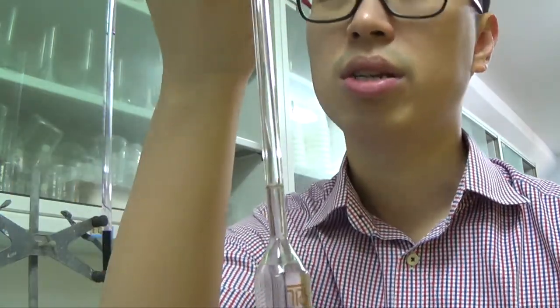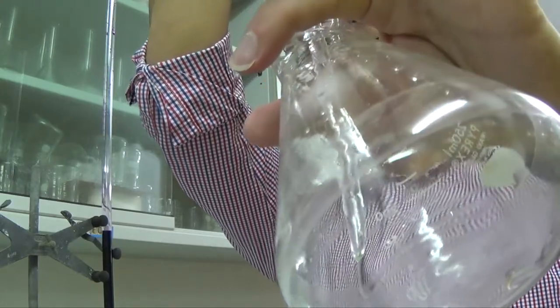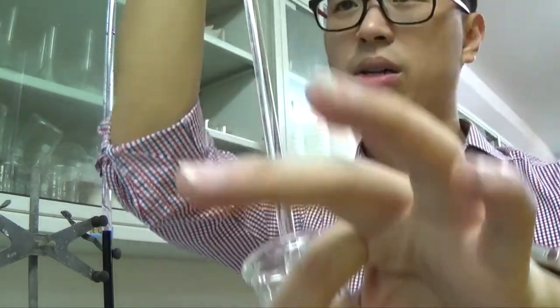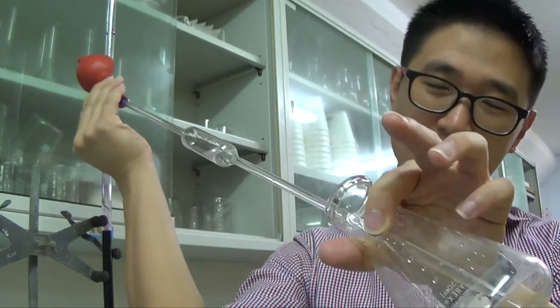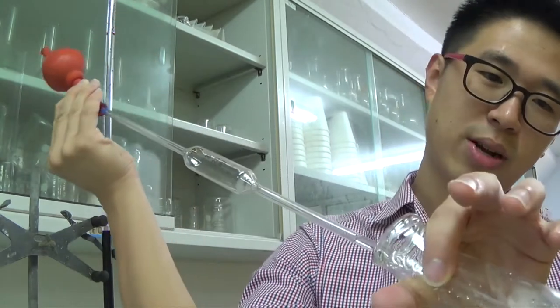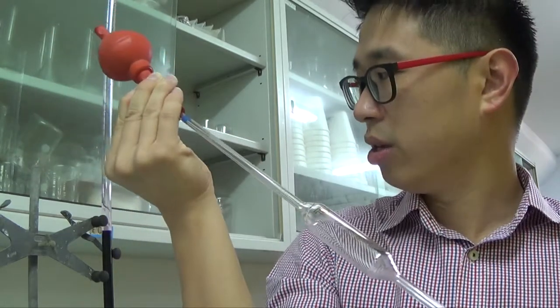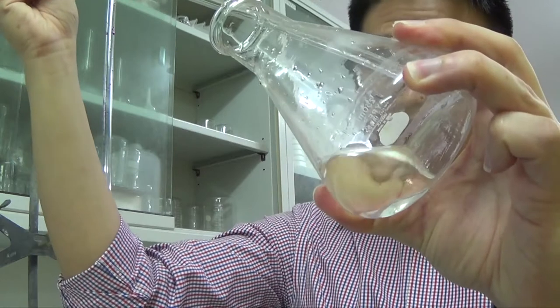Once I press it into the conical flask, which was cleaned with distilled water, not the solution, right? Distilled water. Because if you have a little bit of the solution in here, then it will increase the mole of the Fe2+ in the conical flask. Then it will require a bit more KMnO4 for titration. So take out your, I forgot what that thing is called, pipette filler, and you want to tip the glassware very gently.